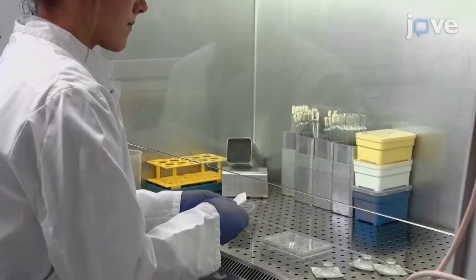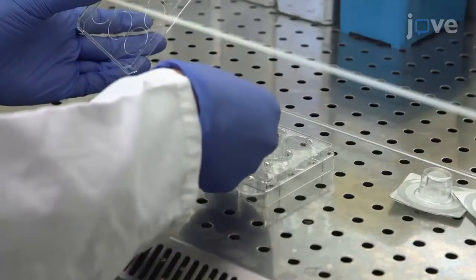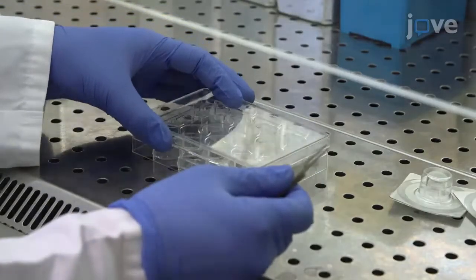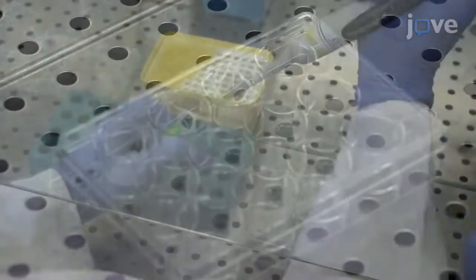Begin by assembling the 12-well plate in a biological safety cabinet. Unpack the plate and each insert, then use sterilized forceps to grab the inserts at their base and put them into the wells.